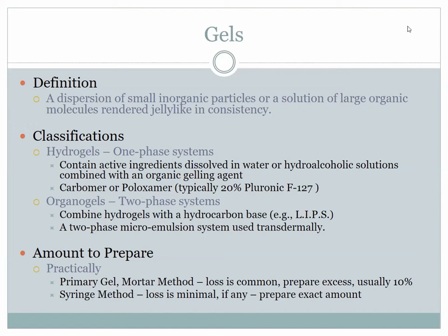What do you think the worst thing you could do to a thermoreversible gel is when you get it dispensed after you've made it? To put it back in the refrigerator. If you put your final product back in the refrigerator, what would it do? It would liquefy. Remember, when the gelling agent gets cold, it turns into a liquid. So after we use it, we never want to put it back in the refrigerator. That would cause a huge problem, okay? So keep that in mind.